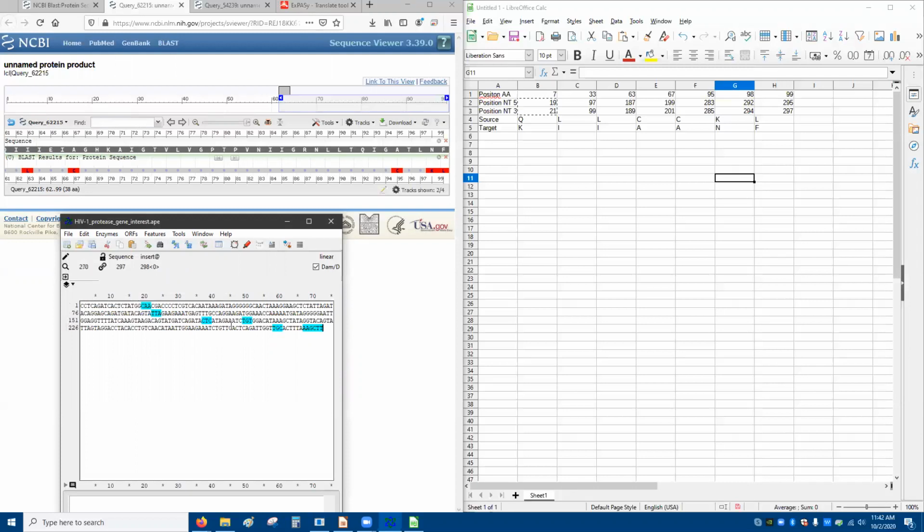You can also add in, we want it to end the enzyme here. So we're going to put in TAG. That's going to help ensure that the enzyme stops.